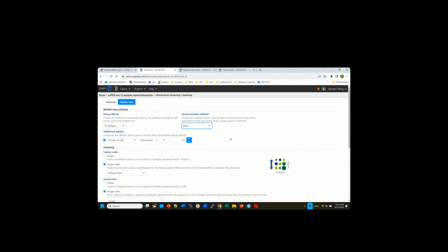In the meantime, I also want to calculate another statistic, because mean is only one perspective. If you have an outlier, your mean can be really off, right? Think about the marker genes. Suppose B cell marker genes. This gene should have high expression in B cells, and also most of the B cells should have high expression. You might have one cell as an outlier that makes the mean really high, but all the other cells don't have expression of the gene. So that's not a marker gene, right?